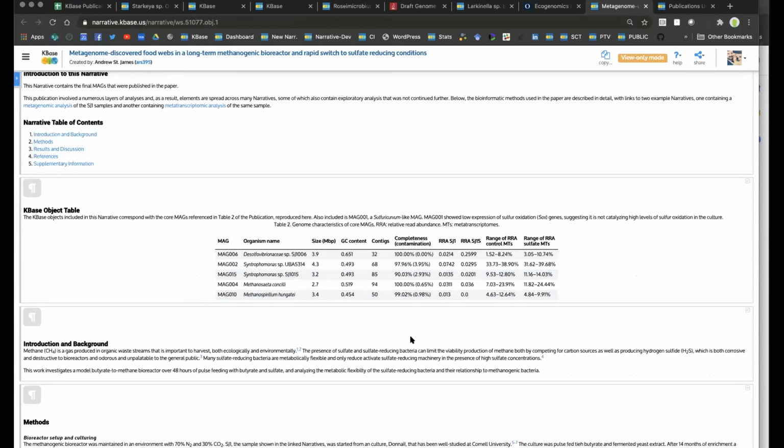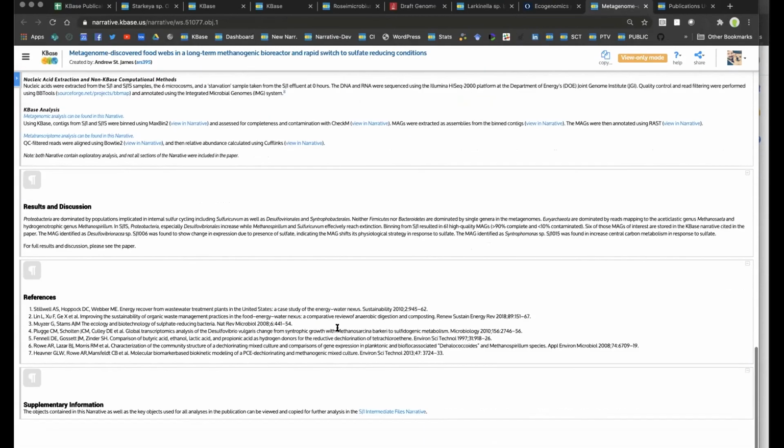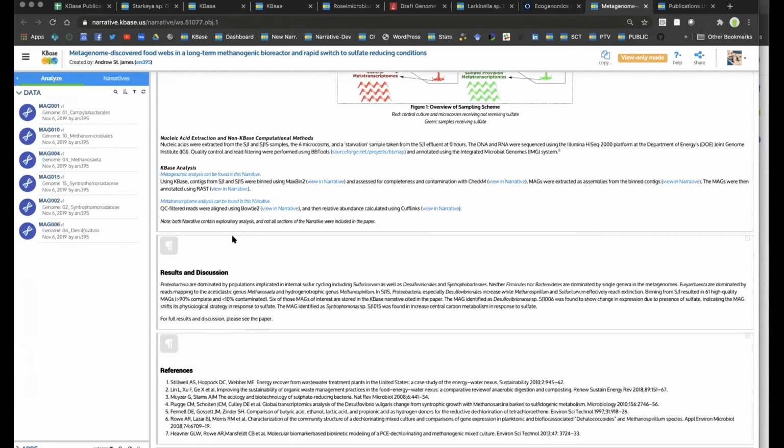where this is just a really rich example of using the ability to craft a narrative with Markdown, with images, with data sharing, etc., and using KBase as a way to share your data and share the analysis that was used to generate the data in a semi-permanent way.